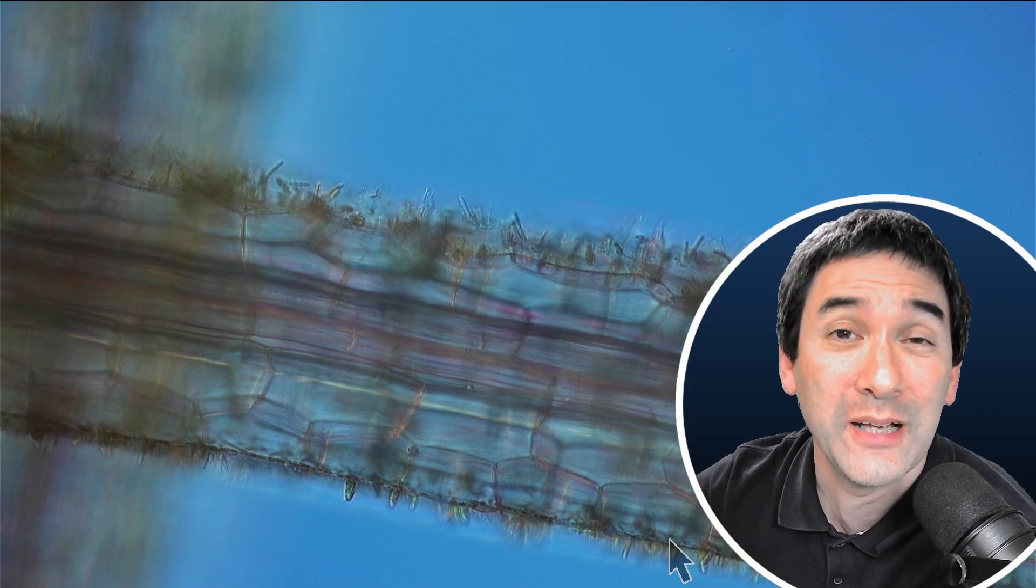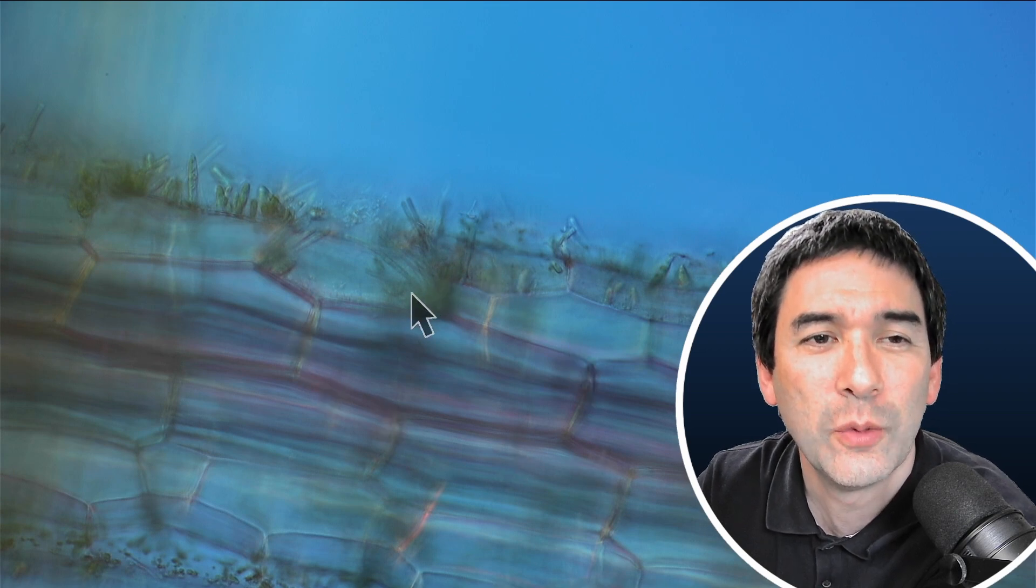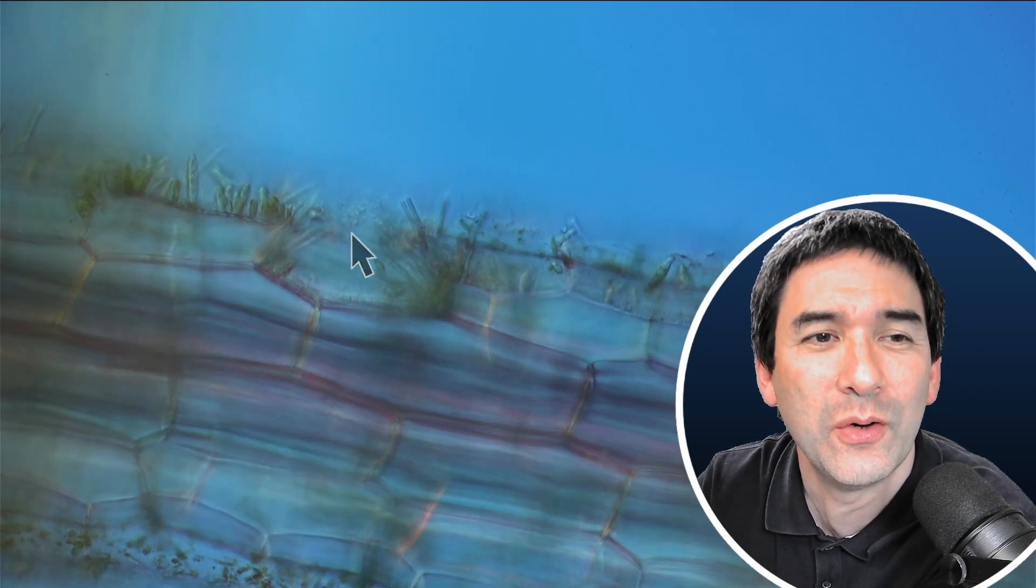I'd now like to increase the magnification further. The depth of field is already quite low here, but we're now looking at the cells of the algal filament and you see how big they are. Compare that to the cell size of the cyanobacteria, which are prokaryotes.